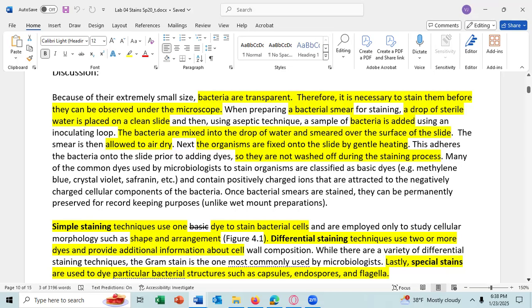There's something I wanted to talk about here. If you were not to smear the water over the surface of the slide, it would eventually dry. It just would take a few minutes longer. And so if you smear the water all over the slide, it will decrease the dry time by a few minutes. You only get minutes, so obviously you can't have the slide sitting for an hour because it'll air dry.